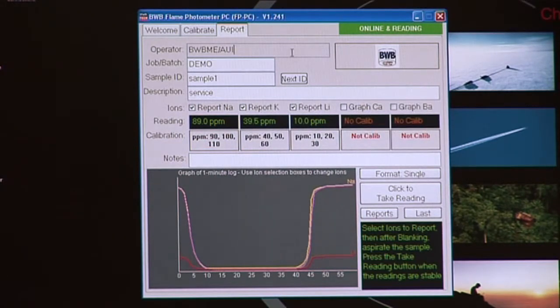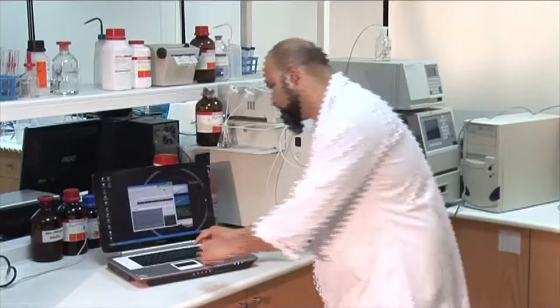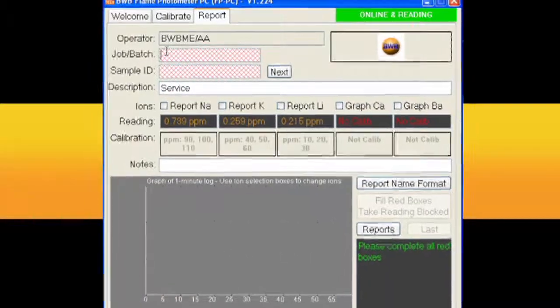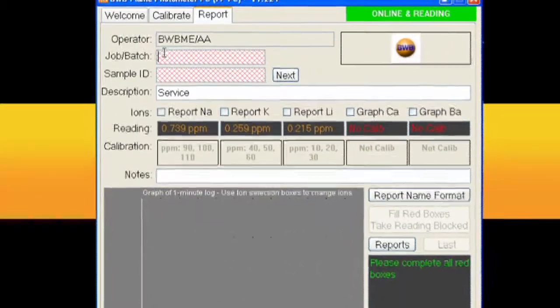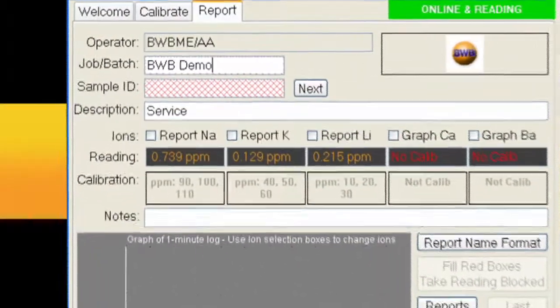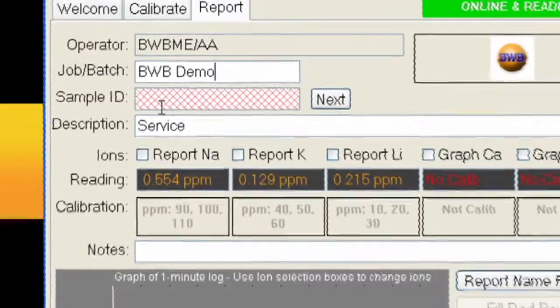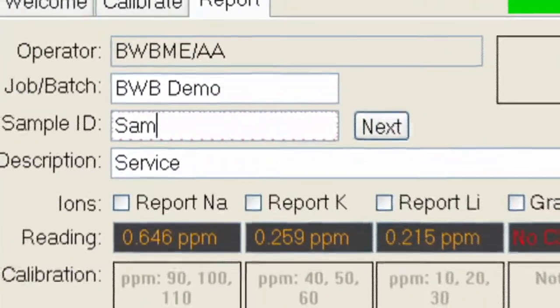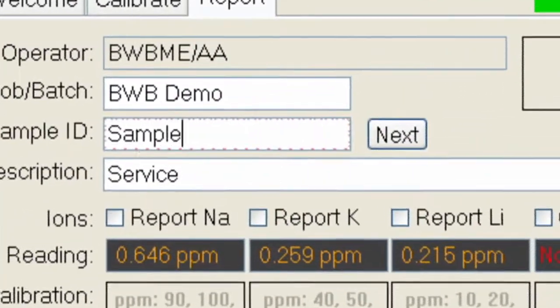The job batch name must be filled in. Let's use BWB Demo. The sample ID box must also be filled in. In this instance let's type in sample 1.